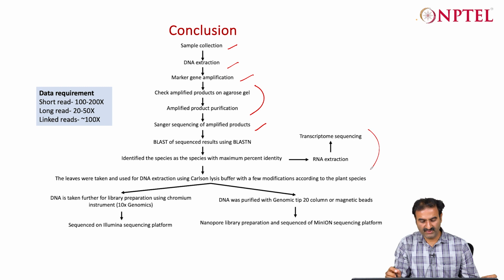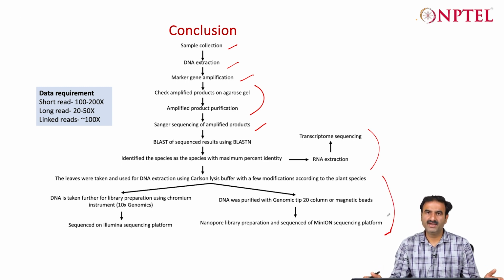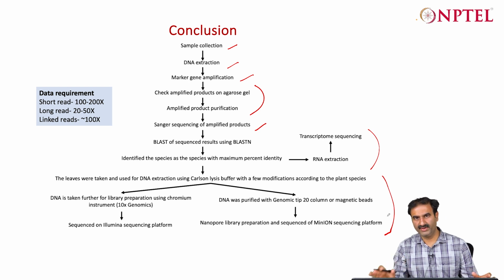Then the transcriptome sequencing, DNA sequencing by both long read and short read, followed up by the chromosomal level assembly by Hi-C. That chromosomal part I am not doing now, we will be doing it later. I don't want to confuse too many things now.